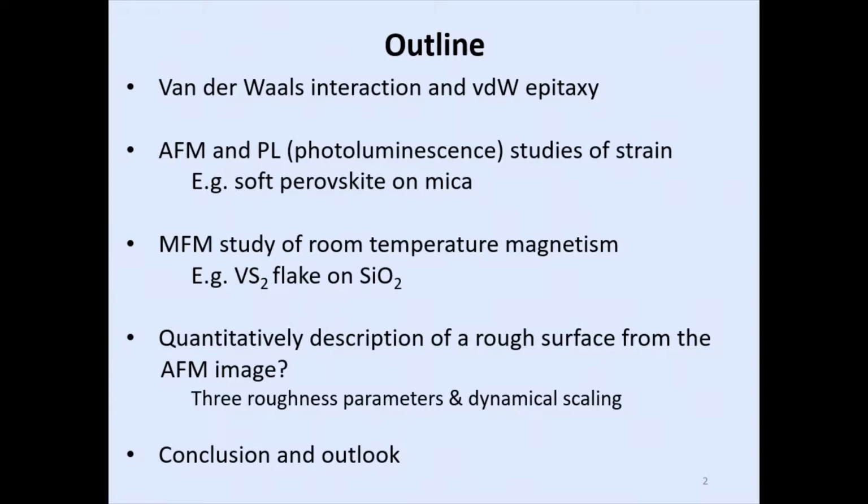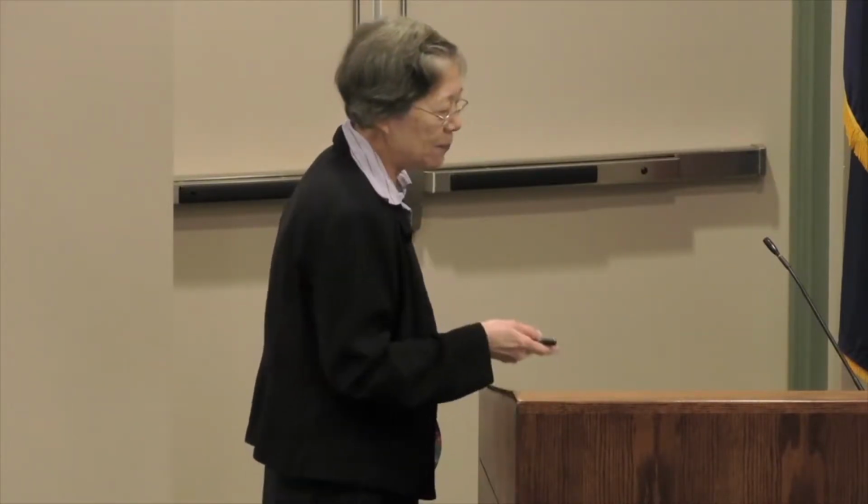Then I thought maybe I can share a finding from my former students, which I think is very nice and related to the AFM work, but I think it's a little bit underpublicized. I hope I will share with you how you quantitatively describe a rough surface from an AFM image.